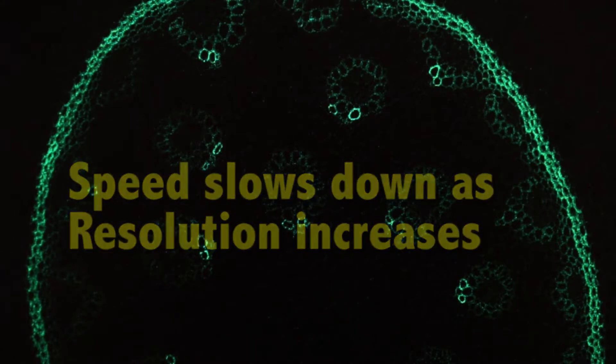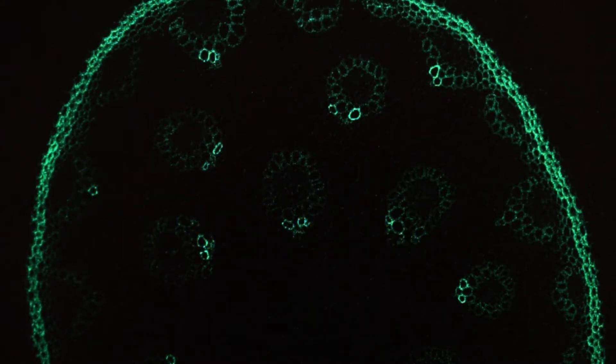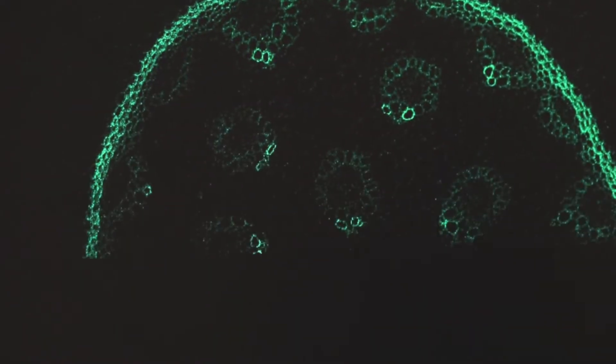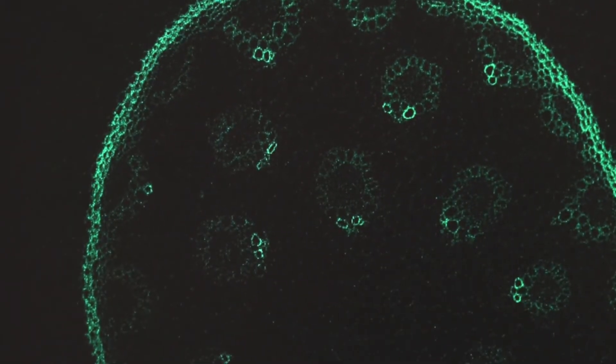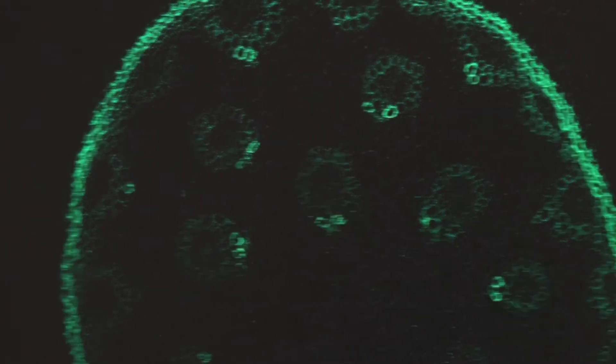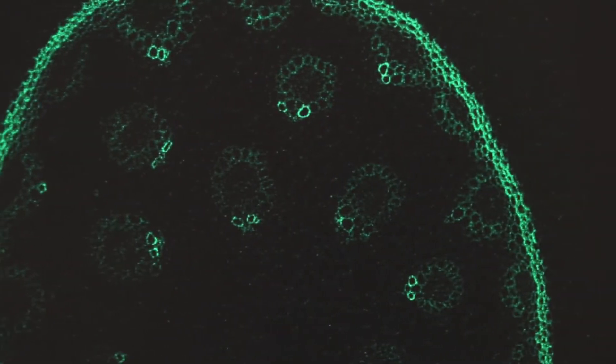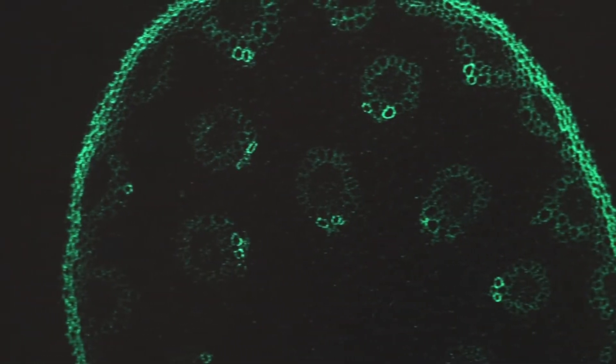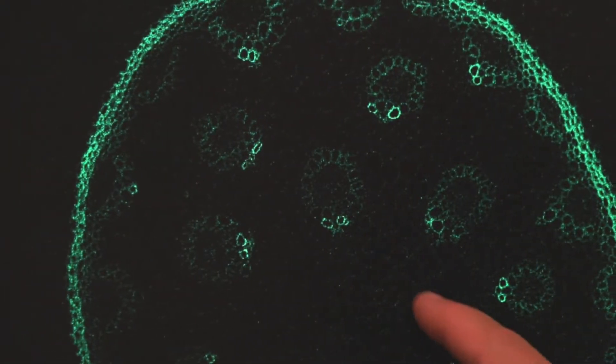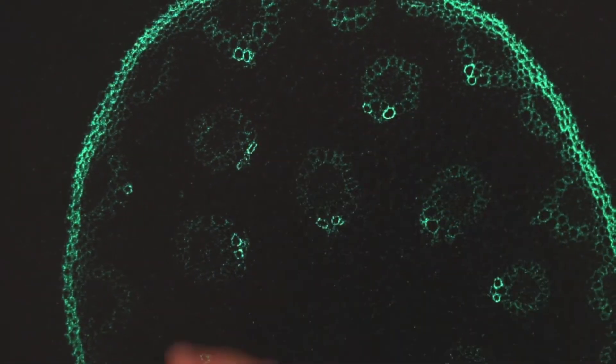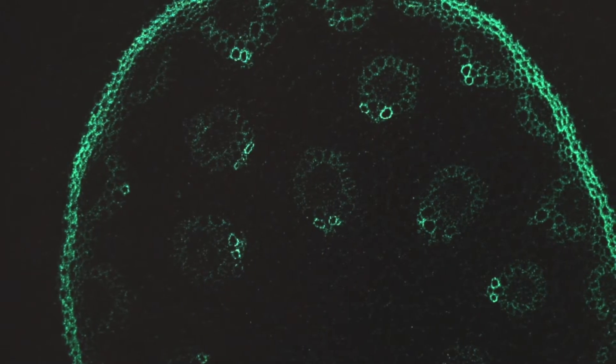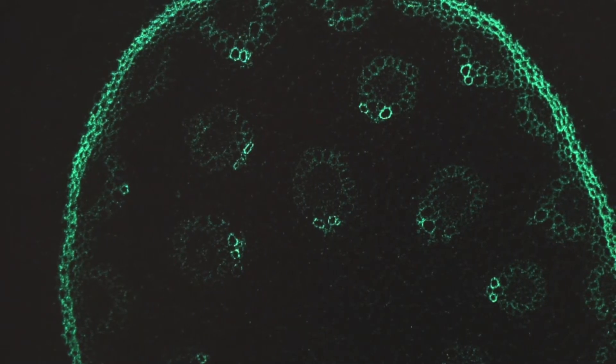If I go to a resolution of 2K by 2K and I capture image, now you see it's slower still. And so this can have an impact on your fluorophore if you're hitting it with too much energy. Another thing that you'll notice is that the amount of noise increases as my resolution increases.